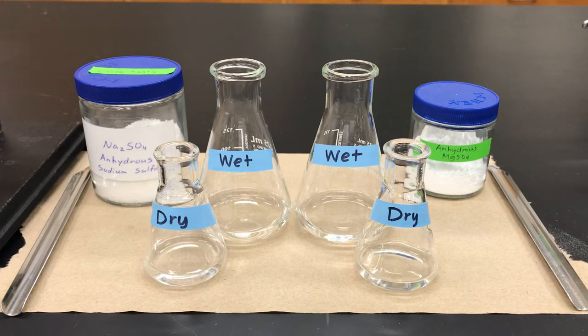Here I have four samples of diethyl ether. Two of them are quite dry and two of them have significant amounts of water in them. I'm going to test the dry and wet samples side-by-side for comparison purposes.